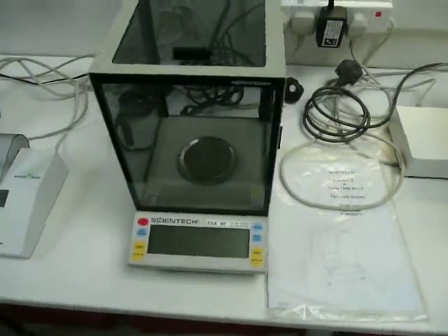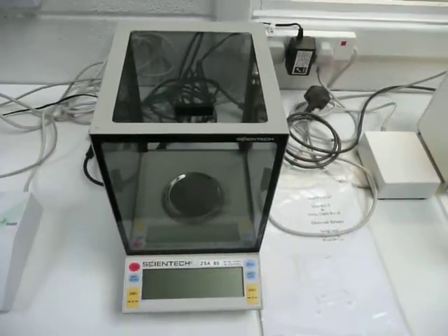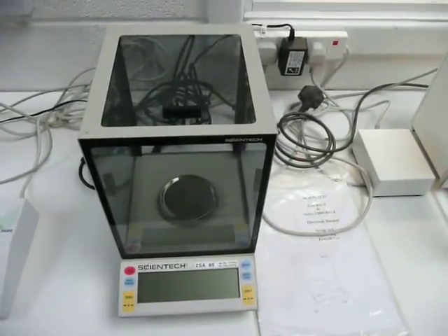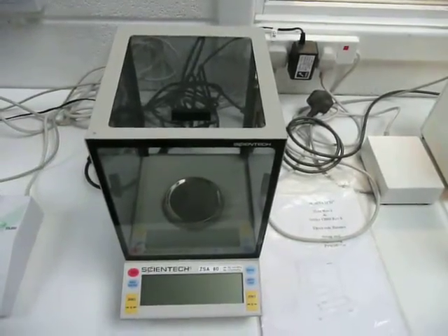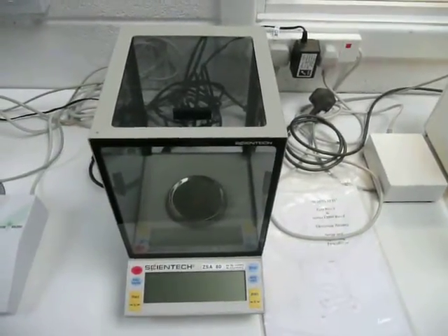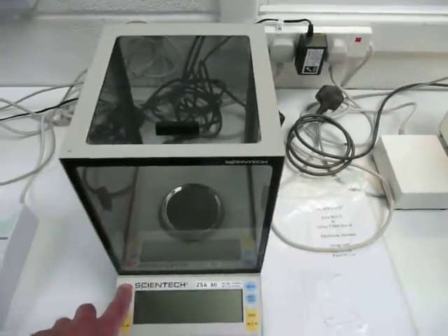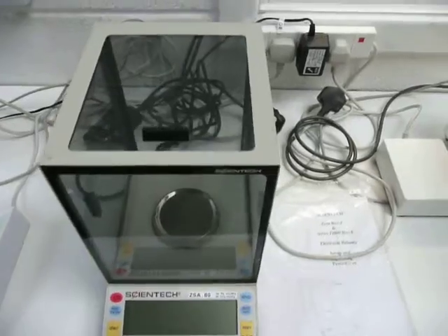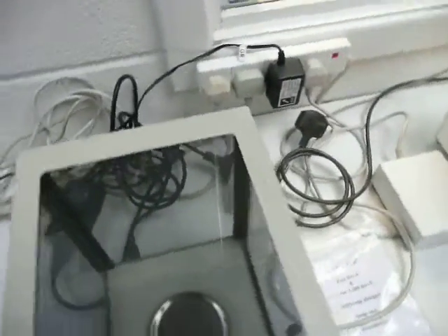Moving on we've got a Scientech ZSA80, again a 4 decimal place up to 80 grams. They do a demonstration in the States where they hammer the pan — it's that robust. It's supposed to be the most robust balance worldwide and that's what this company sell them on, that they're an extremely robust balance.